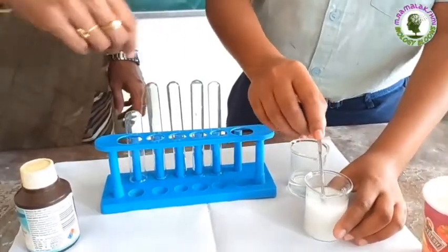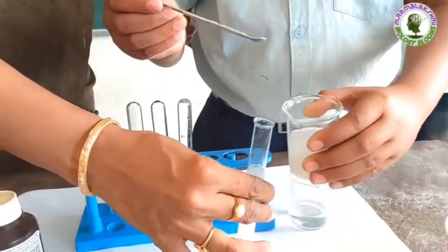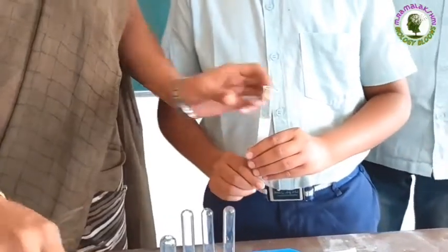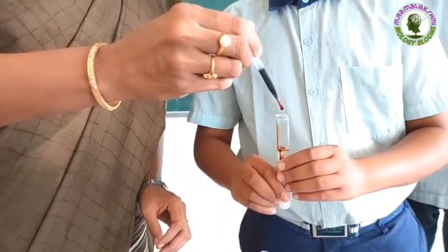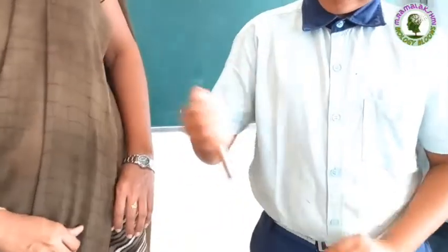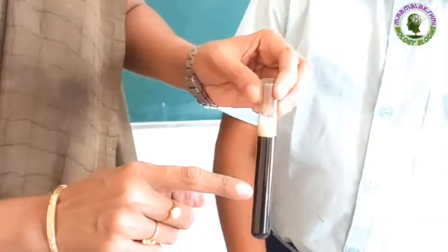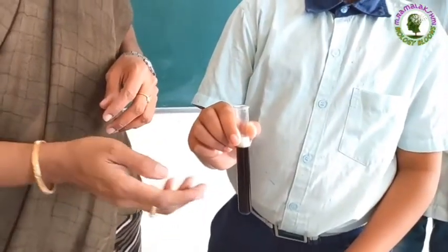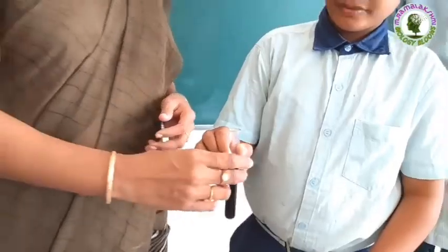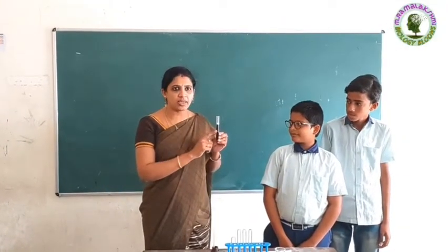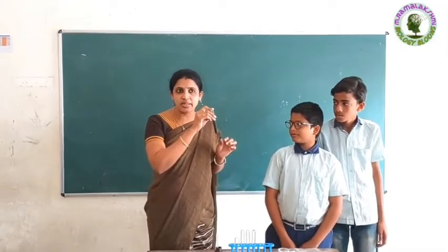Okay Shyam, is it ready? Now take some starch solution into a test tube, then add some iodine drops to it and shake it. Children, what is its color now? Blue-black color. Can anyone say why this solution turns blue-black? It is indicating the starch. Yes, very good. Children, if any substrate turns blue-black when iodine is added, that indicates the presence of starch. So this rice flour solution contains starch.